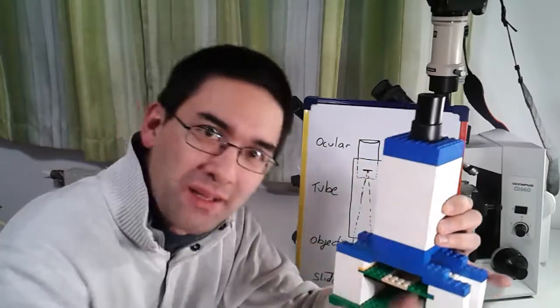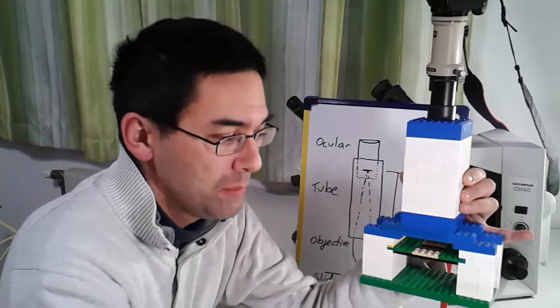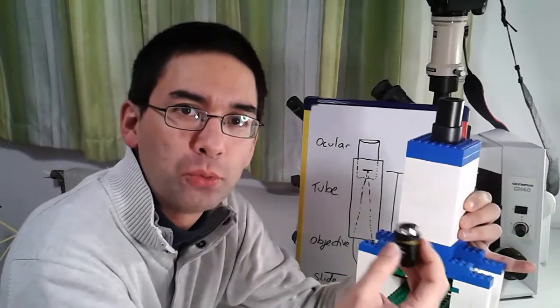Actually, I'm going to take this one apart so that you can actually see how I made it. This microscope here is right now magnifying 40 times, but if you attach a larger objective, then it can magnify up to 100 times.